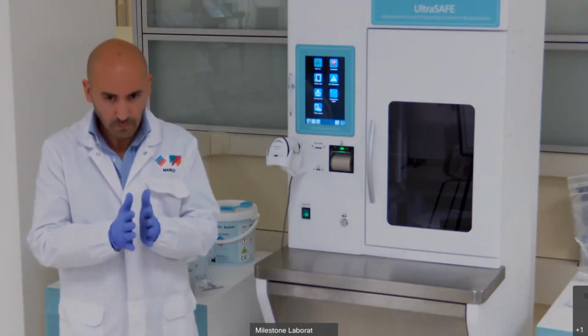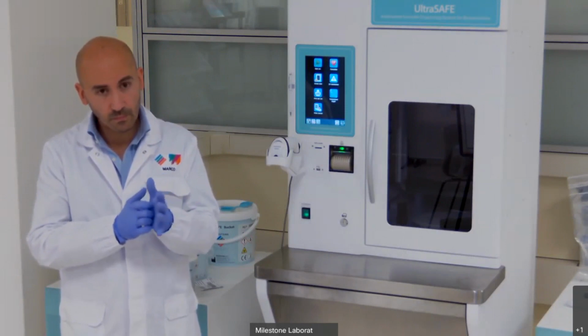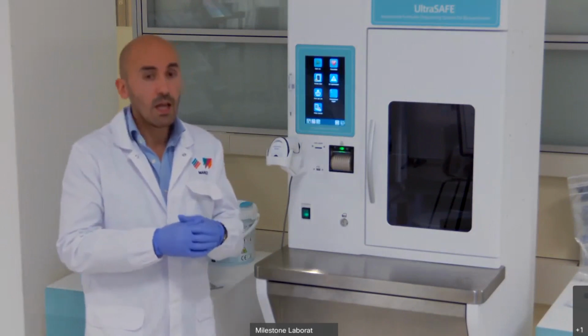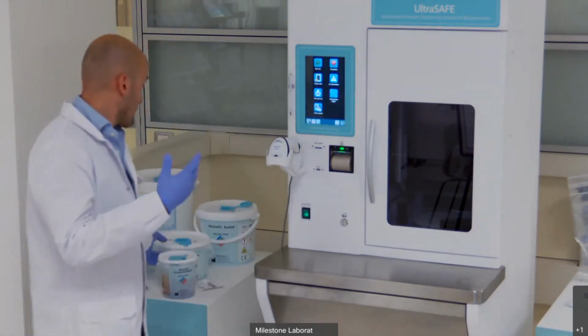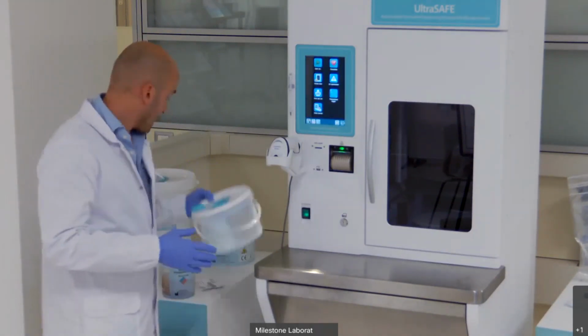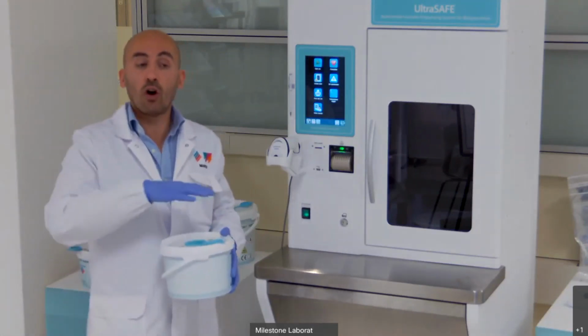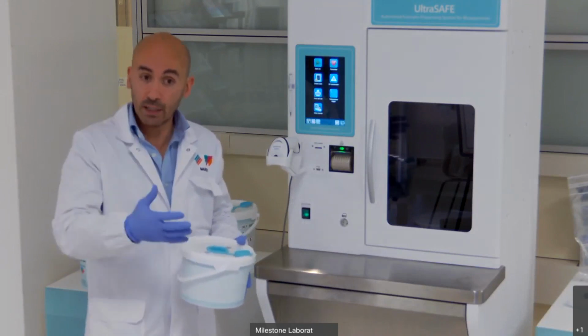What happens if I put an already closed bucket in the unit? Do we risk formalin spillage? Okay, the answer is no. Because the unit is designed to work only in ideal conditions.